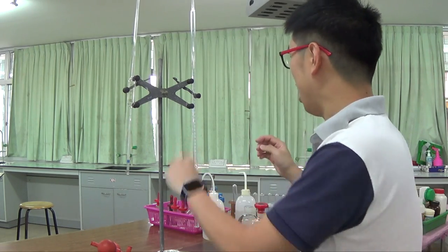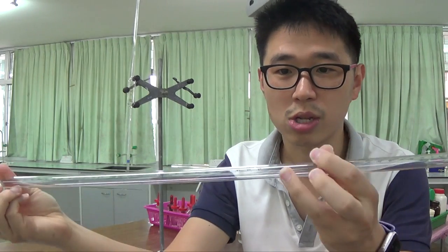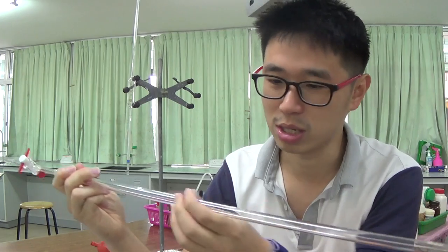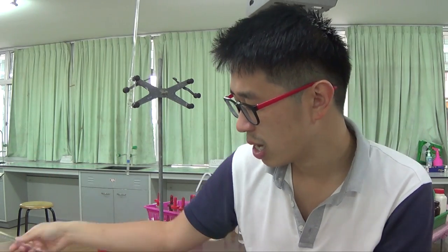Okay? Anyway, so this is a burette. In case you've never seen a burette, it's got a tap at the bottom. This burette is reasonably clean. I just used it the other day, and I have washed it with distilled water before. It's got some marks on the outside, but they're just superficial, cosmetic marks.